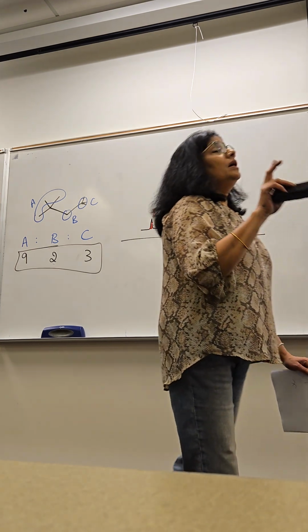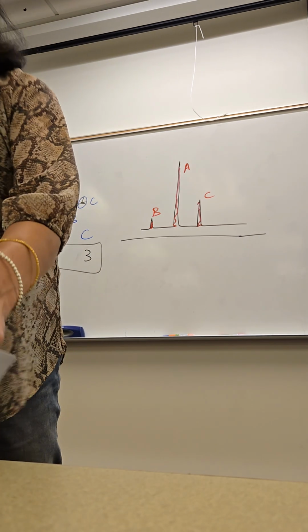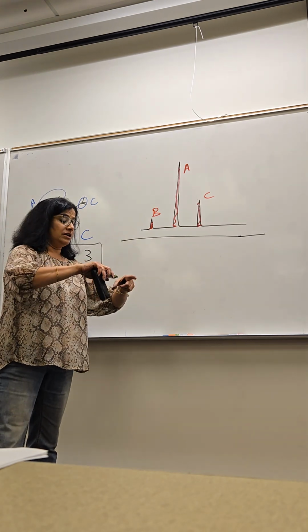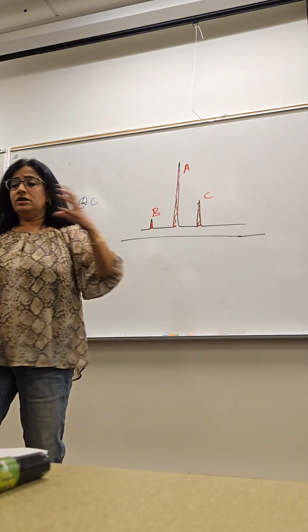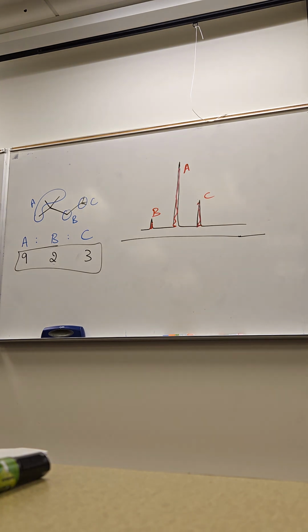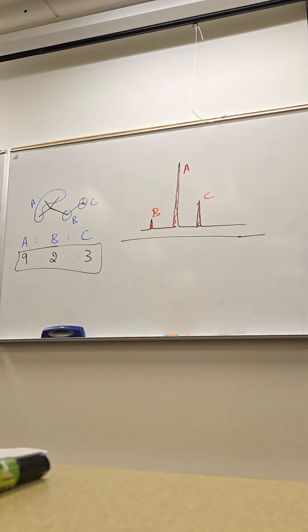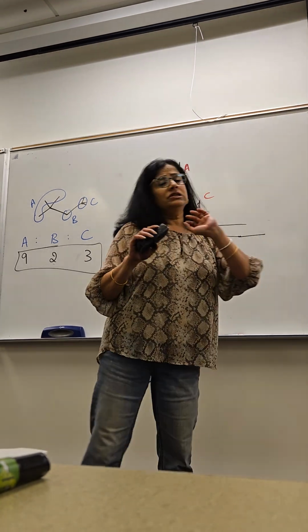Yes and no. No, because at the level of the technique we are studying, we can't just use this information; we need to collect all 4 things and put them together. It's like solving a puzzle. You get some clues here, some clues here, then you put it together and come up with an answer. Then I said yes, because the NMR we are studying in this course is probably only 20% of the NMR that actually exists. What we are studying is a very simple one-dimensional NMR.